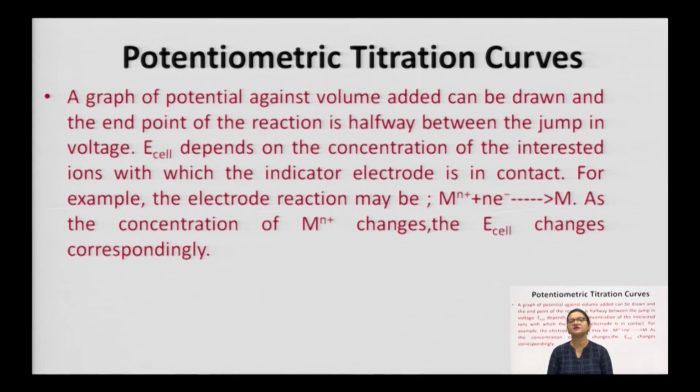उससे हम ये पता कर सकते हैं कि हमारा जो एनालिटिकल सॉल्यूशन है, what is the concentration of analyte in our analytical solution at a given moment or at a given time of the titration.